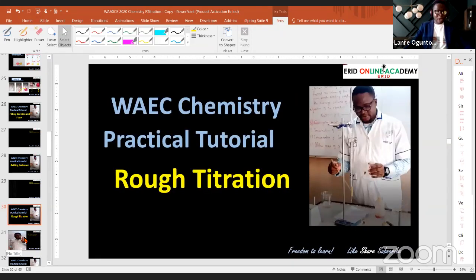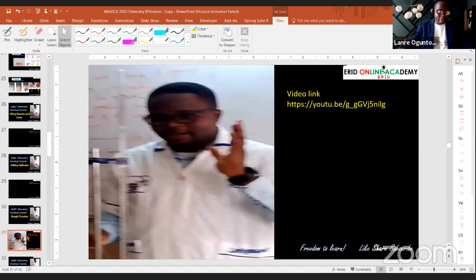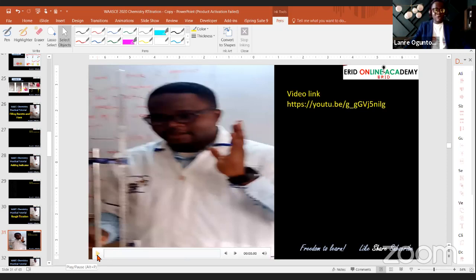So I'll show you how to do rough, carry out your rough, and how to record your rough value. Be noting down all the questions that you want to ask me, before we now go into calculations. It's very important that you get your titer value very well.